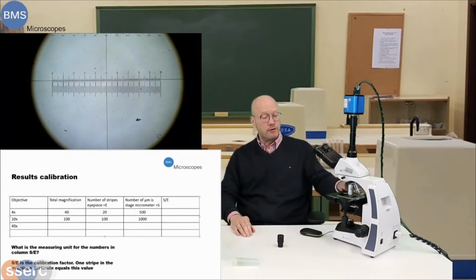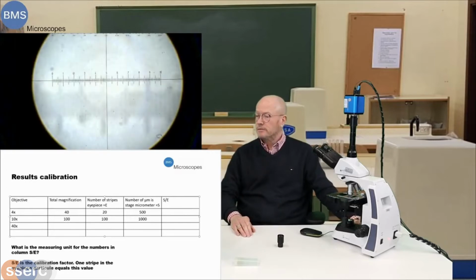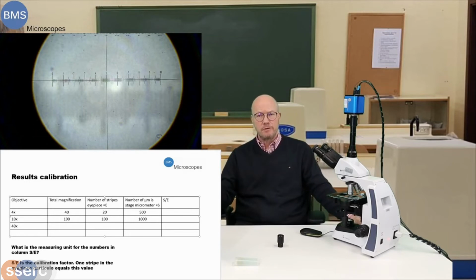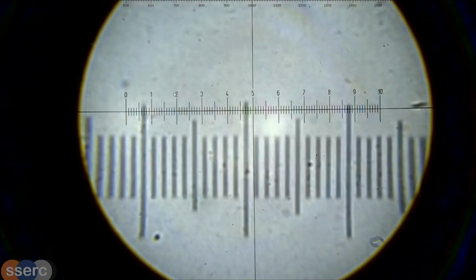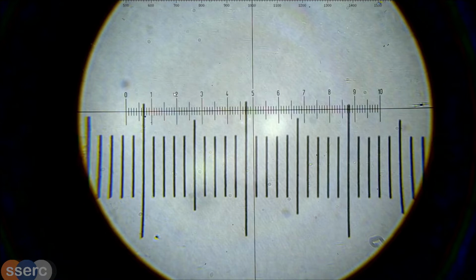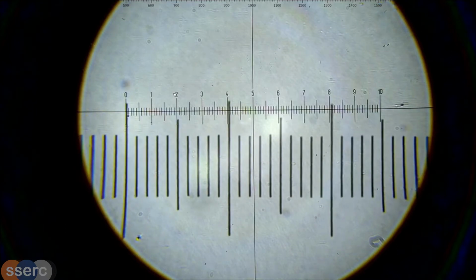Now we go to the 40 times. I have to turn up the light a little bit. The higher you go in magnification in microscopy, the more critical the light becomes. So higher magnification also requires a bit more illumination. Let's find the stage micrometer here. Here it is in focus. Make sure it is in line with the ruler in the eyepiece.